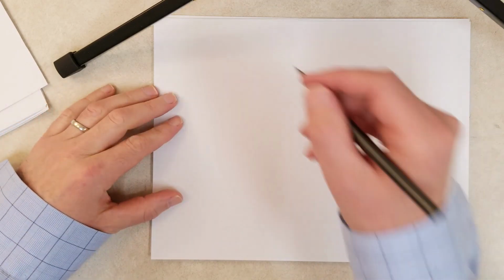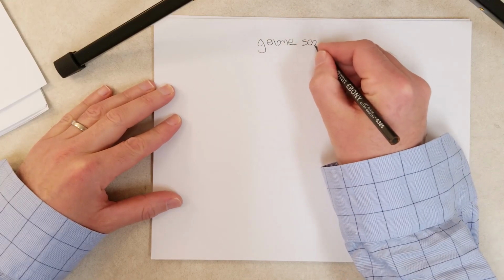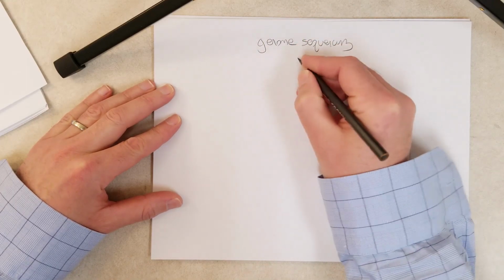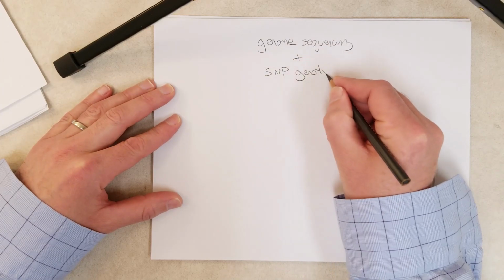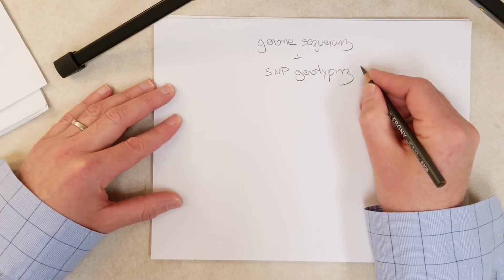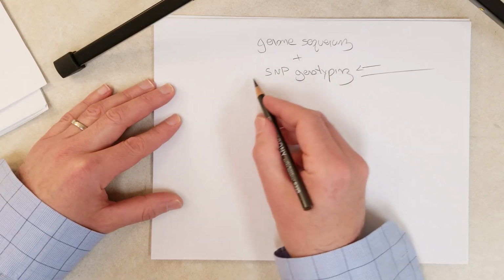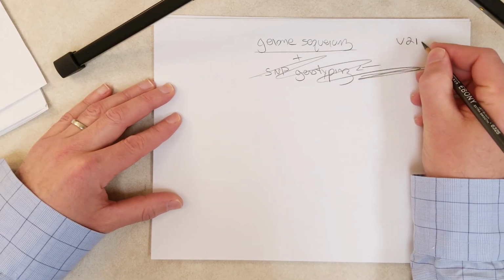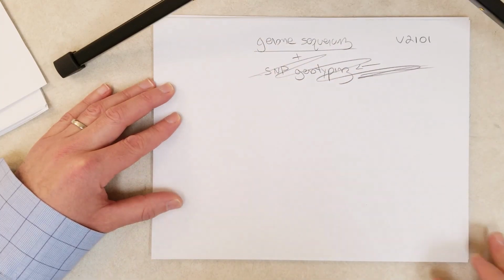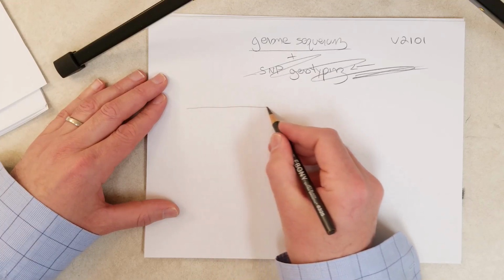Hey everyone, in this video we are going to cover the difference between genome sequencing and SNP genotyping. And we're going to learn a little bit about how SNP genotyping is performed. So essentially genome sequencing, and we talked a little bit about genome sequencing I think in video 2101. Now genome sequencing is pretty great, but it's pretty expensive too.